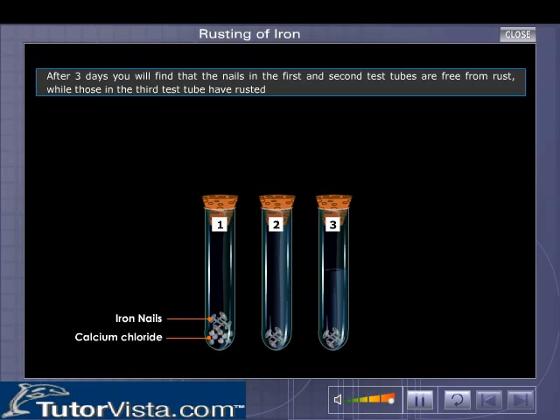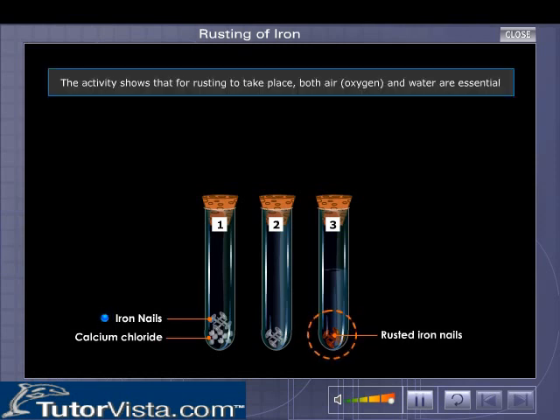You will find that the nails in the first and the second test tubes are free from rust, while those in the third test tube have rusted. The above activity shows that for rusting to take place, both oxygen and water are essential.